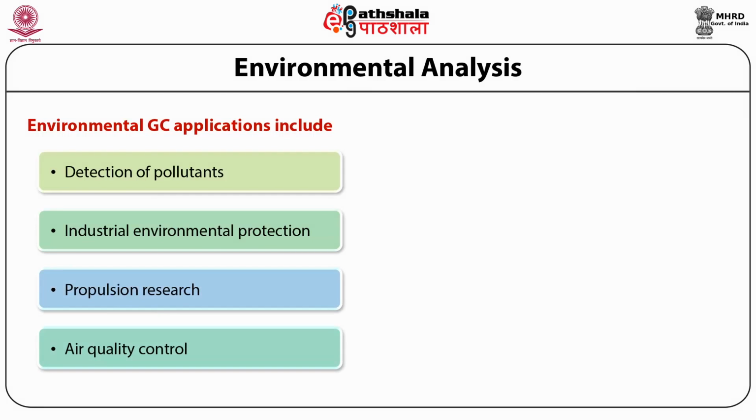Air samples can be analyzed using GC coupled with flame ionization detector, that is FID, as it has more sensitivity and resolution.